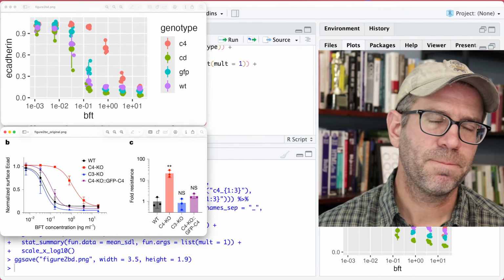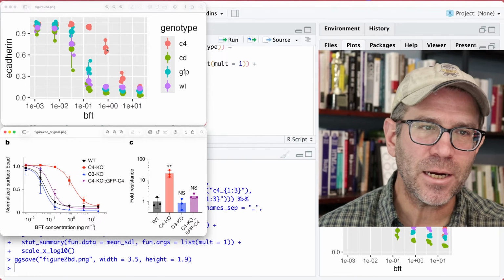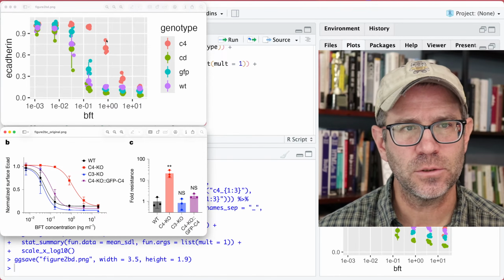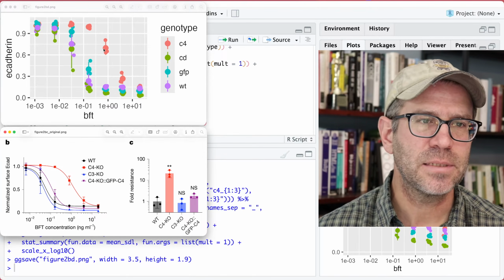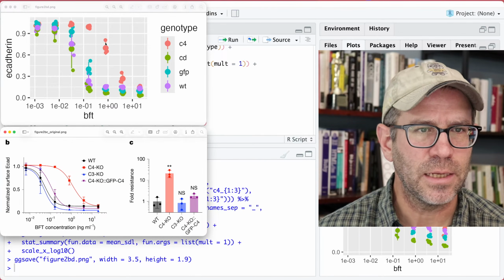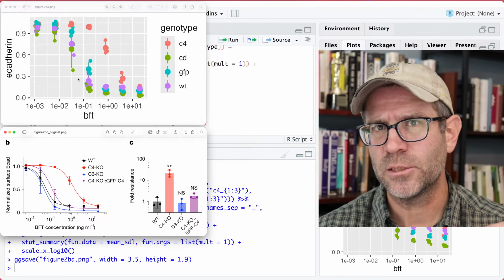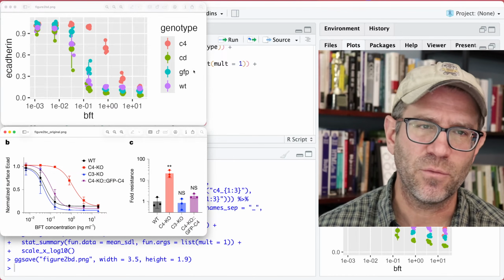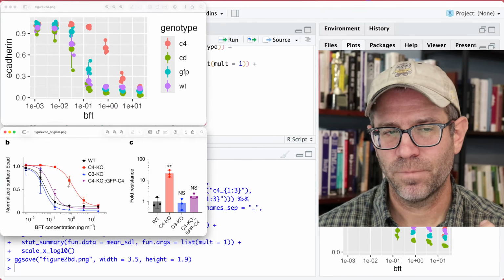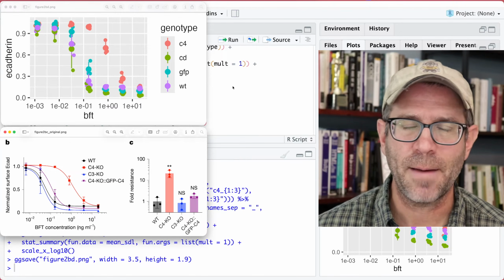And so now what we see is that our mean is a bigger circle than what we were getting with geom_jitter, right? So geom_jitter gives these smaller circles, like this small red one, whereas stat_summary is giving me this slightly larger circle. And you can probably also see that line coming up out of that red circle, or this purple line, right? That's the pointrange geom, where you get a point and then a range out from that. To replicate what they had, I need a confidence, an error bar, right? With the little hats at the top and bottom.